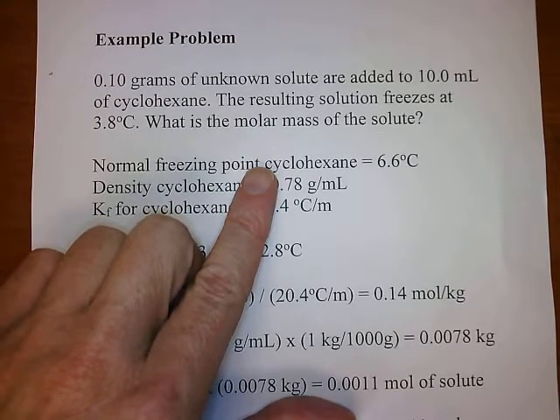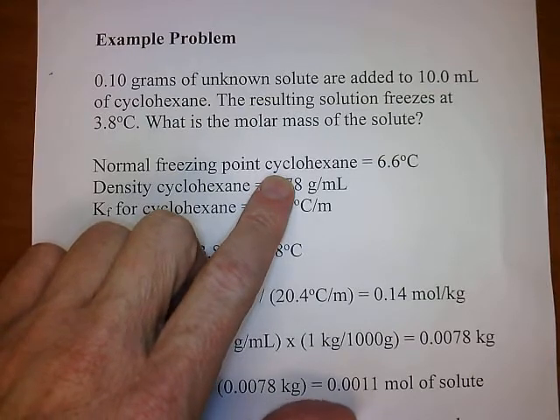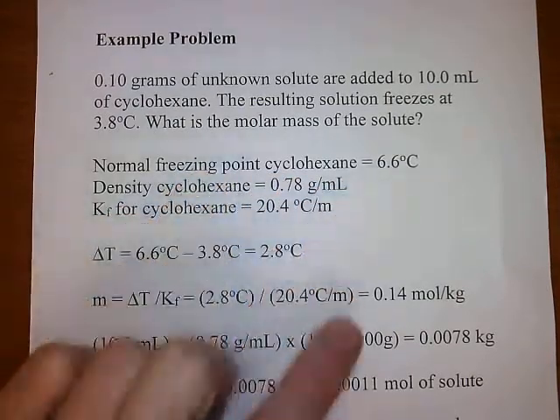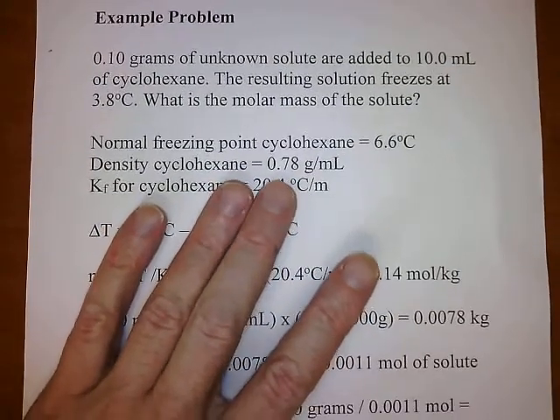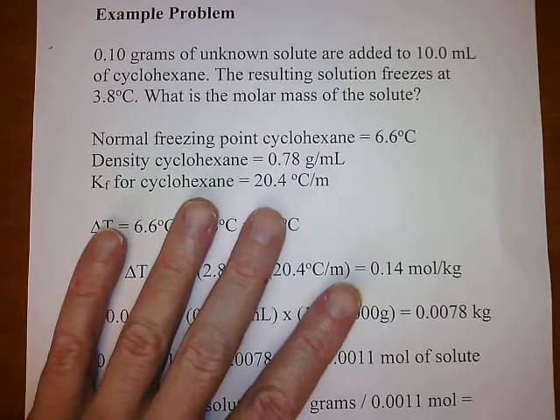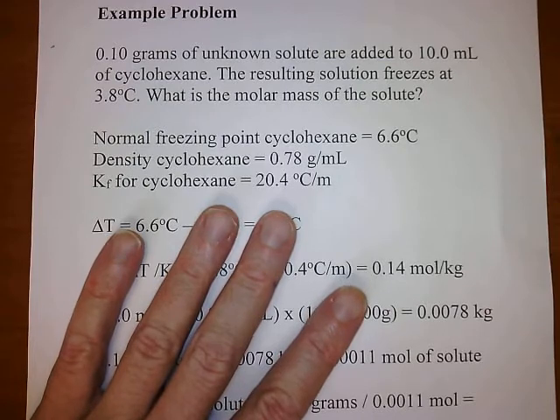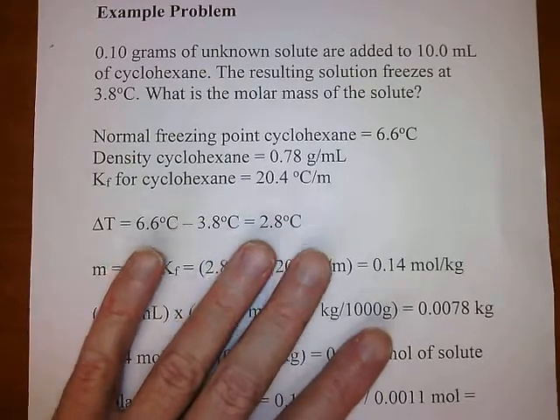So there are three things we're going to have to know. We're going to have to know the normal freezing point of cyclohexane. That's 6.6 Celsius. Knowing the change in freezing point tells us nothing unless we know the normal freezing point. So the normal freezing point for cyclohexane is 6.6. The density of cyclohexane is 0.78 grams per milliliter. And the freezing point depression constant for cyclohexane is 20.4 degrees Celsius per molal.